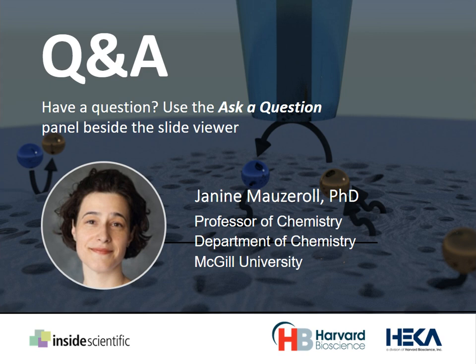Excellent. Thanks, Janine. Next question here from Daria, who's asked, is it possible to image the concentration of the ions involved in corrosion and to distinguish between their oxidation states needed for the corrosion mechanism? Yeah, could you read it one more time to make sure I'm answering the question correctly? Sure. So she'd like to know if it's possible to image the concentration of the ions involved in corrosion and to distinguish between their oxidation states necessary for the corrosion mechanism.